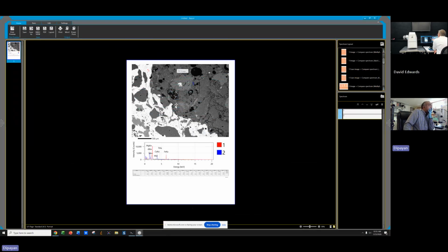Right, but yeah, then yeah. So I mean that's one way to do it. If it were me, I would probably send them as separate. If I'm going to do them, one is a metal and one is an oxide, I'm not going to put them in the same graph. I'm going to put them on two separate pages. Okay, yeah, but usually I don't do that. I'm just doing this for this session, but you are right. Usually I do metal and oxide separately, completely.